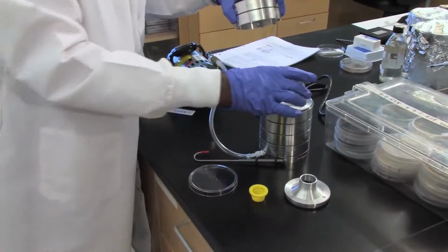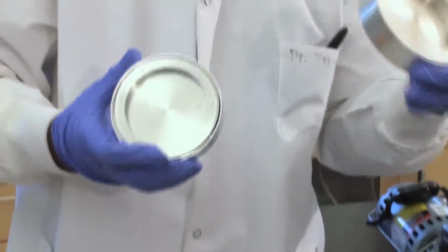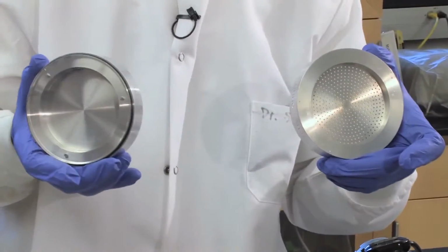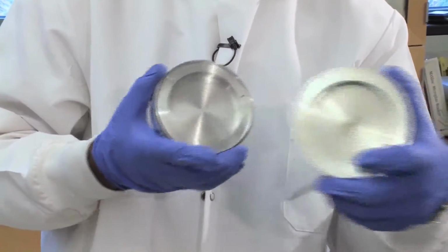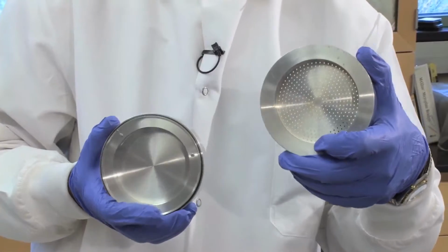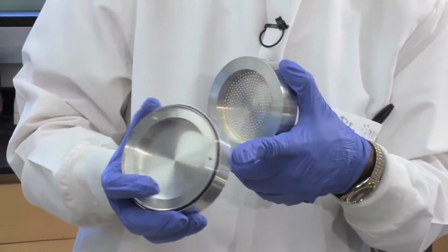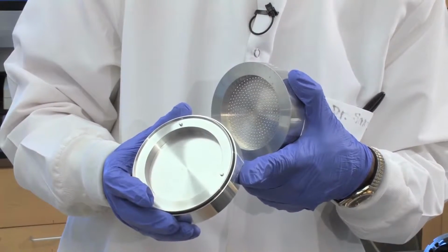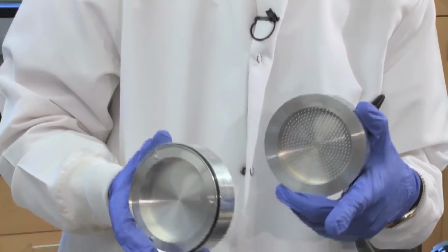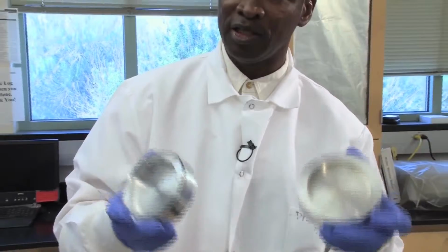I'm going to put a plate for the second one. So this is on the top of the system, and this one is on the bottom of the system. So you're looking at particulate of 7 micron above going through here, and any other particulate smaller will go through it. And this particular ring we're talking about letting through 0.5 to about 1.1 micron. So as I mentioned earlier, it's based on the theory that's been developed from how air is taken in through the respiratory system of human being.